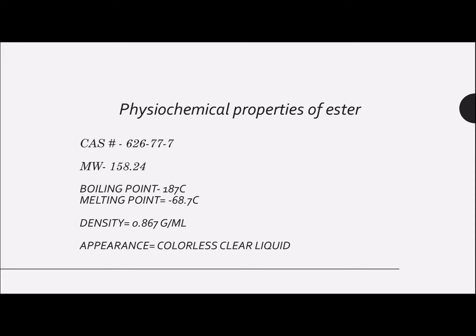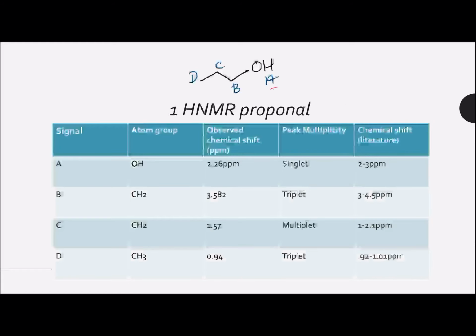So we do end up getting this, and the appearance of our ester is really a colorless, clear liquid. We'll talk a little bit more about the appearance and properties of this later on in this video. So let's move on to the HNMRs, or just the spectrums in general.